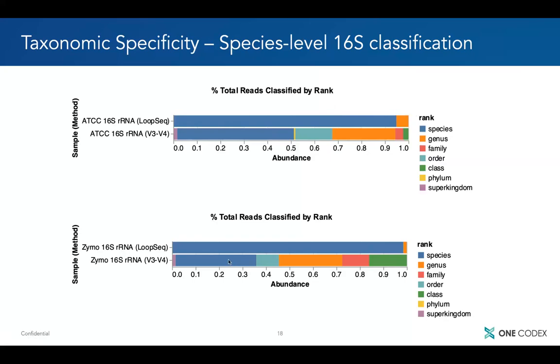Some of these species calls are erroneous, and they're due to sequencing error looking like known real variants. And we have a lot of data that's just fairly nonspecific. So we have a lot of reads that map to the genus level, or that map to the order or family. These aren't quite in order. Class, etc. And so each of these reads doesn't tell us as much.